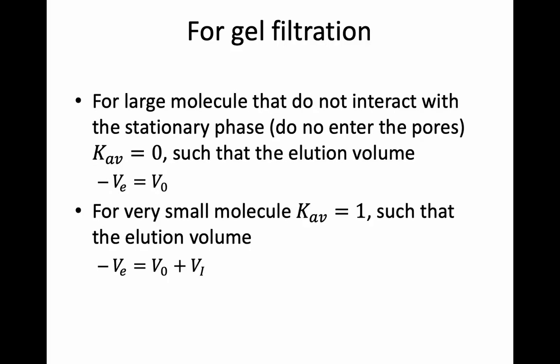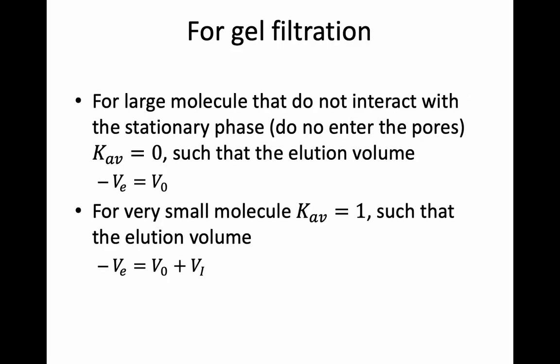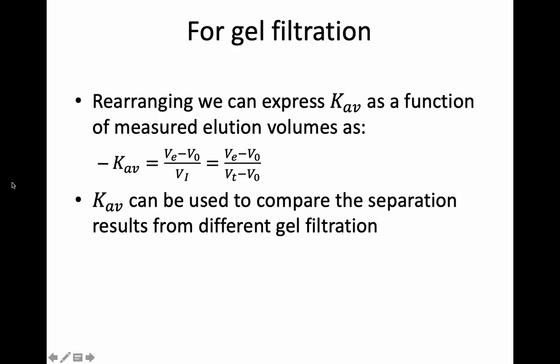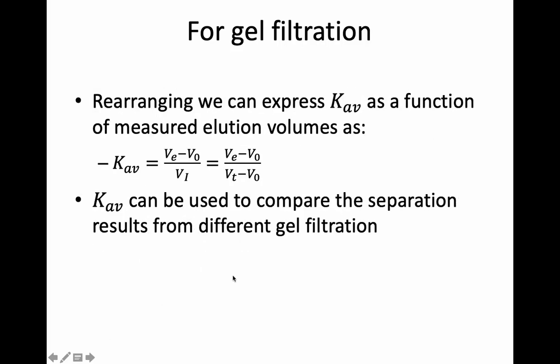Knowing this relationship and rearranging the previous equation, we can determine the gel partition coefficient, which is a measure of the interaction between your stationary phase and your analyte, as the difference VE minus V0 over VI, right?